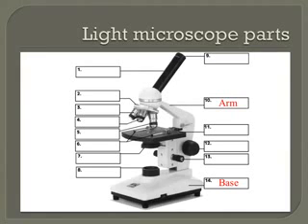When you first begin using a microscope, you'll probably need to get the microscope from the microscope cabinet. Since these microscopes are very expensive pieces of equipment, it's important that you take proper care of them. When you move the microscope from one location to another, hold it with one hand on the bottom or the base of the microscope and another hand on the arm of the microscope, which holds all the other pieces together. By doing this, you're much less likely to drop and damage the microscope.